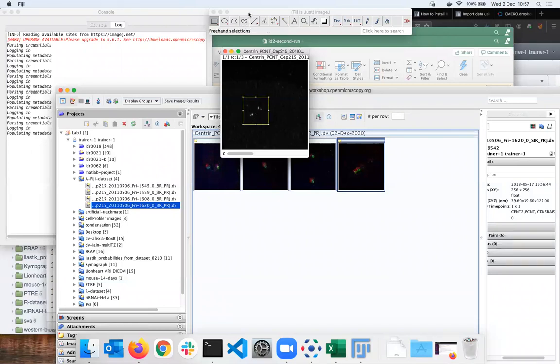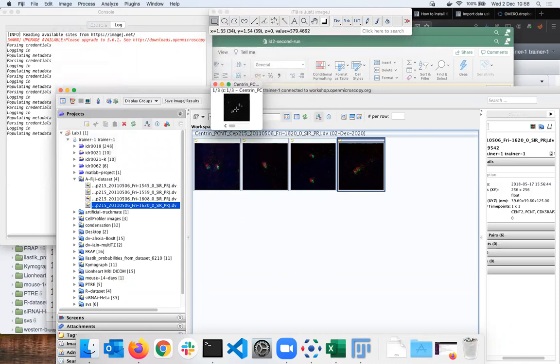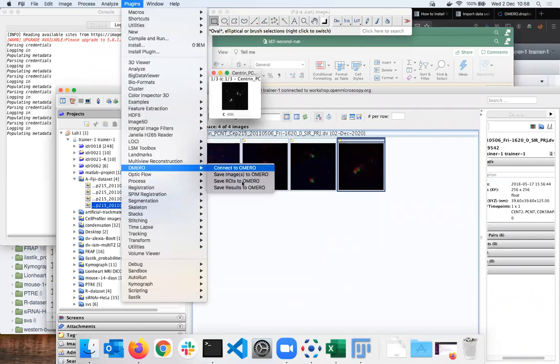Because this workflow is intending to demonstrate the capability of creating a new image, I am not now putting the ROI into the ROI manager. Instead, I go image, crop. This is probably the easiest workflow which produces a new image for me. And this cropped image, by the way, OMERO cannot do crop out of the box, but Fiji can do it for me. Like this.